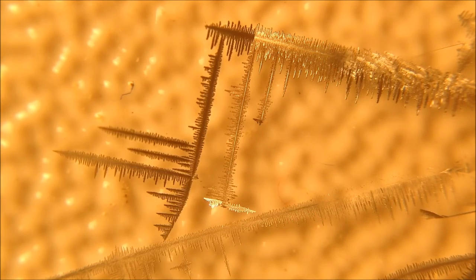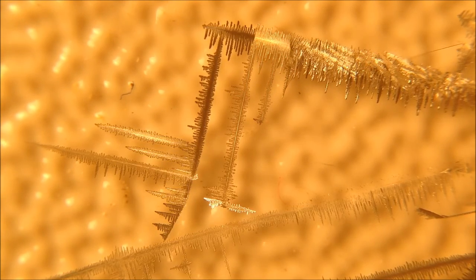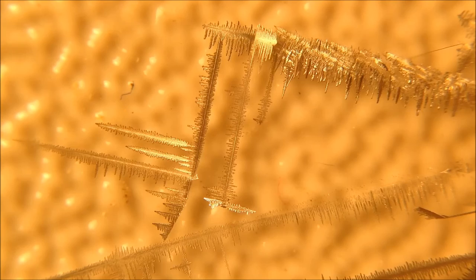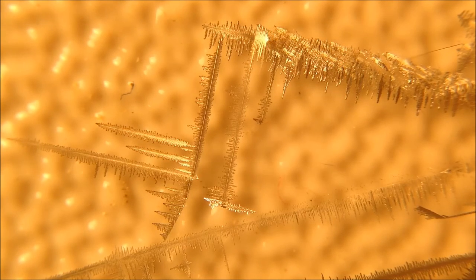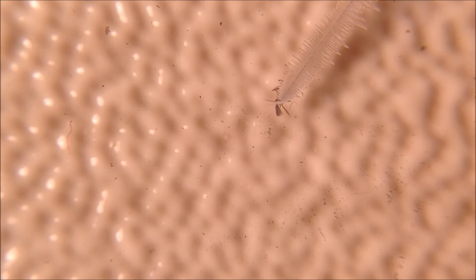The sugar snake didn't quite go as planned, and the hexamine didn't quite fill the mold. Perhaps there was too little hexamine or too large a mold. The day was a little bit windy, so it was difficult to light, but overall I would say it worked. So just be aware that your mileage may vary when using this kit.